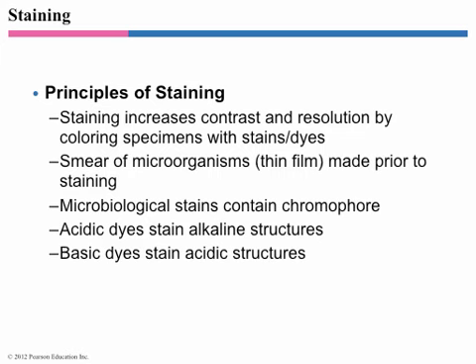Negative things like DNA is negative. The membranes are negative. Ribosomes are negative. Proteins could go either way, but you actually don't want proteins to stain most of the time because there's going to be proteins everywhere and the whole cell will stain. Acidic dyes are used in a few specific circumstances for staining either basic structures or to get a negative stain, which we'll talk about in just a second.